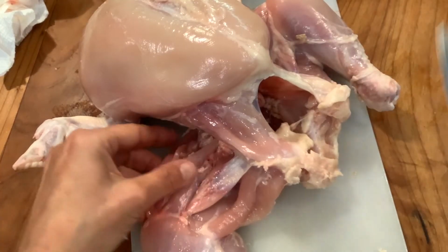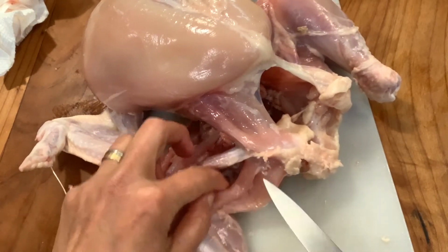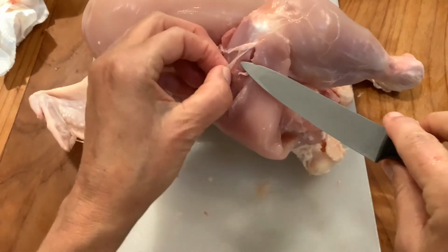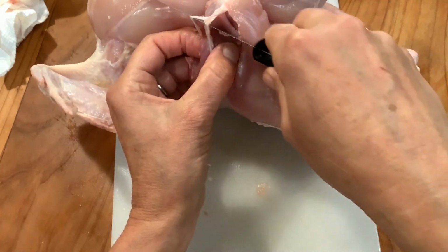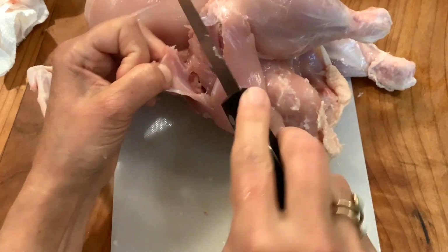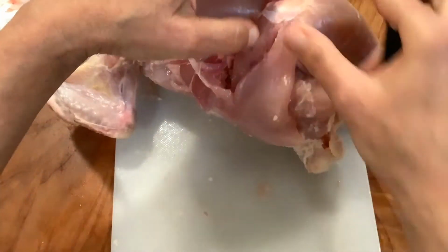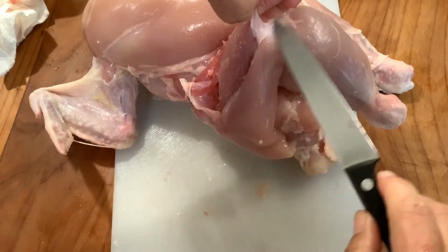So I think I'm going to transect some of these muscles so we can look deeper on them. So I'm going to go ahead and transect the IT band and peek underneath it. To transect something, you're going to put your cut through it perpendicular to the direction that the muscle fibers would be going in, and then reflecting it is to open it like the pages in a book, to peel it back. And then we'll see if we can find the vastus lateralis, which is the lateral quadriceps muscle.